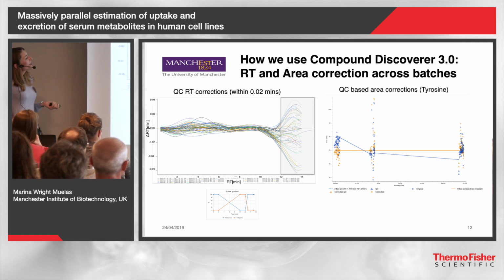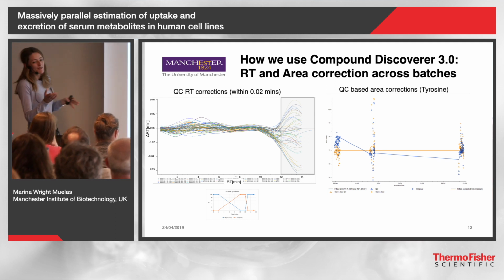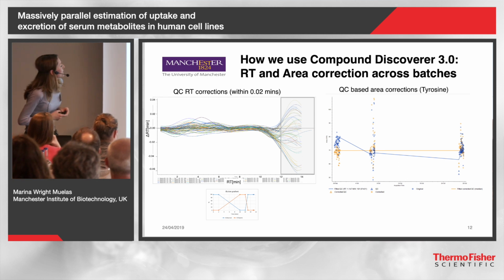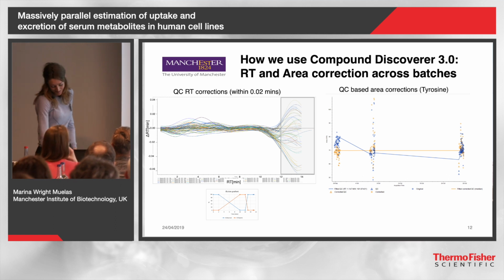One minor niggle I'm finding is that you can't really see the plots very well. Hopefully the software team can do something so we can change the font sizes, etc., on these kinds of plots. I know you can do it with one of the other plotting functions in Compound Discoverer, but with these ones I've just had to use PowerPoint. So it would be really useful to have that.